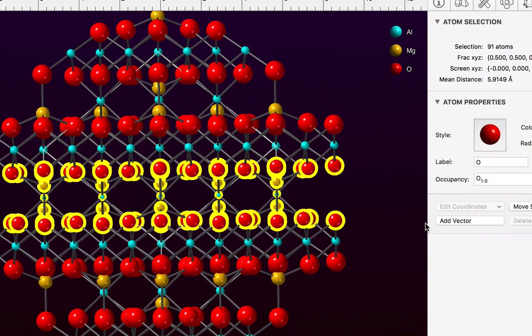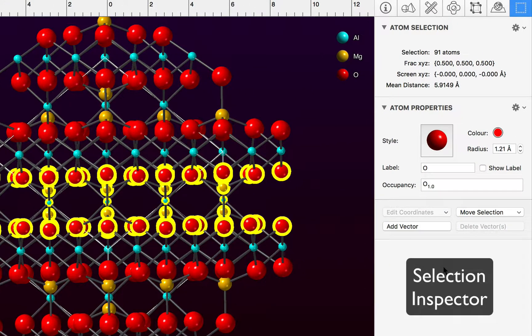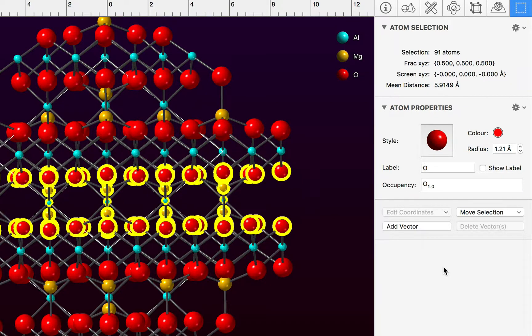Now on the right hand side of the screen we have our selection inspector. Anything that is selected has its properties displayed here and you can see I've selected 91 atoms.